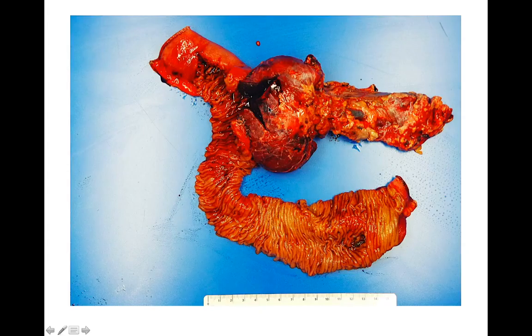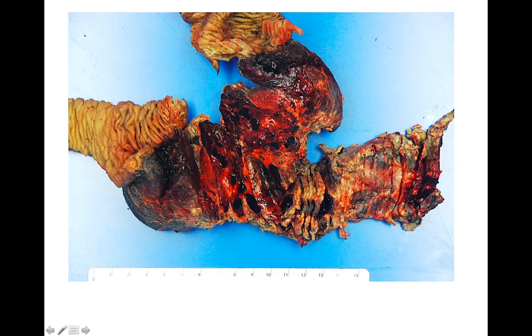So with that being said, let's talk about our first case. This is an adult. They underwent a Whipple, and we're seeing here a large piece of duodenum, so potentially duodenum. There are two staple margins, no stomach over here. It doesn't seem like there's any stomach here. And there's this really hemorrhagic mass over here. You can see it serially sectioned, tons of hemorrhage. So what could this be?